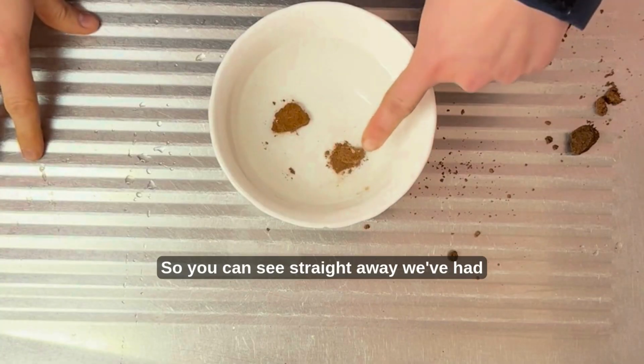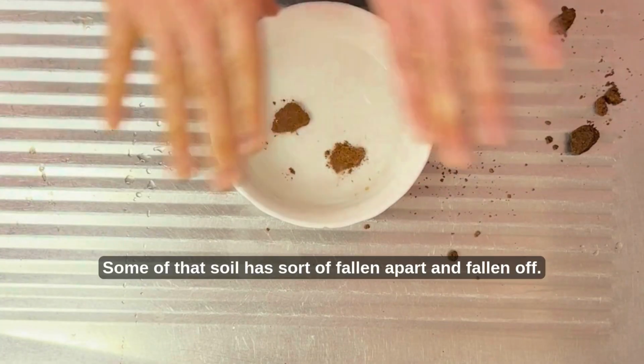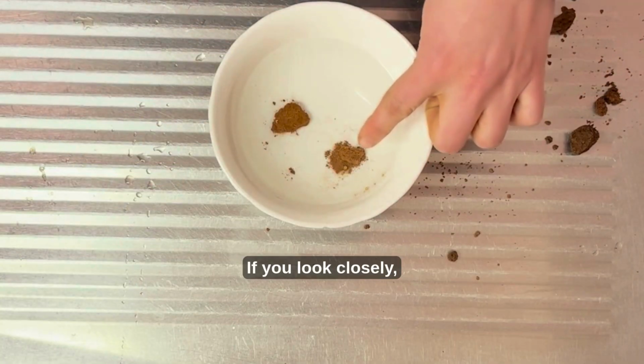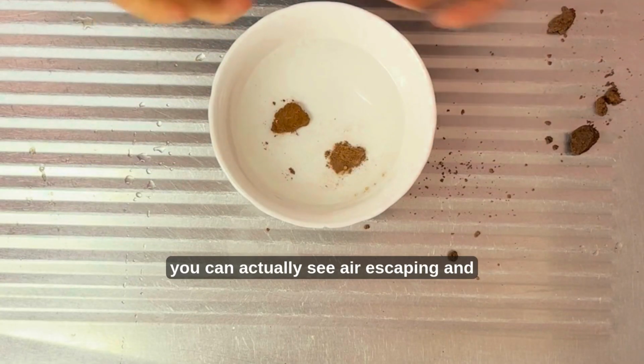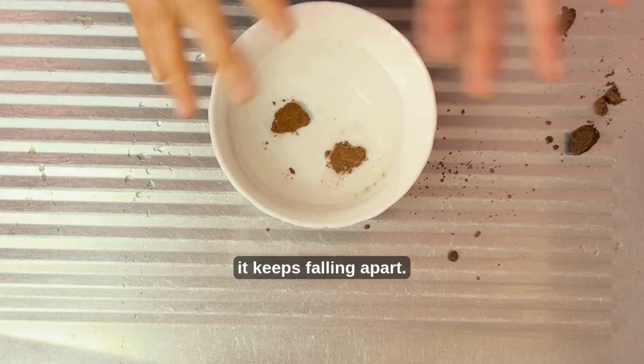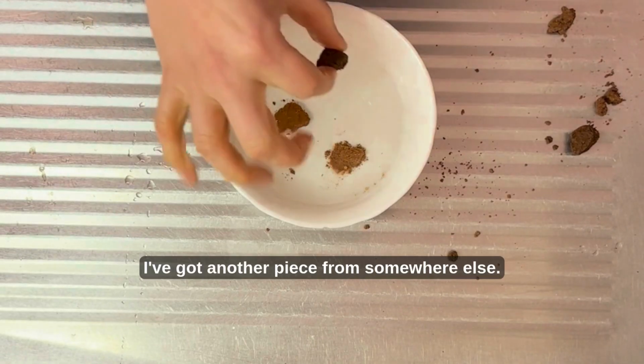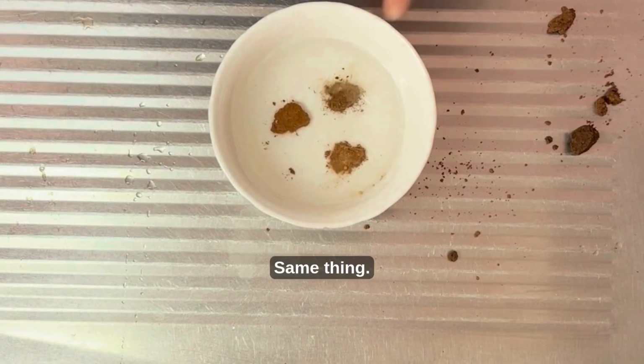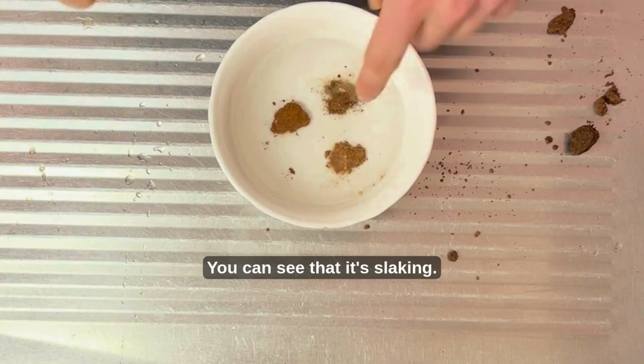So you can see straight away, we've had some slaking. Some of that soil has sort of fallen apart and fallen off. If you look closely, you can actually see air escaping and it keeps falling apart. I've got another piece from somewhere else. Same thing, you can see that it's slaking.